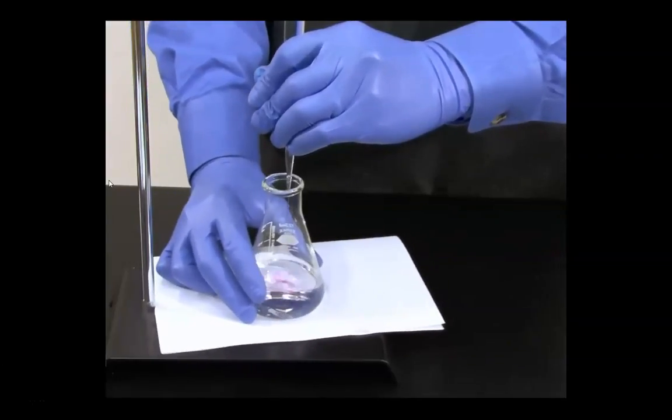With the titration complete, we need to read the level of the liquid in the burette. Going back to the beginning, recall this picture. The level of sodium hydroxide, reading from the bottom of the meniscus, is between 2 and 3 milliliters. But we have to read it downward. So this is about 2.9 milliliters.